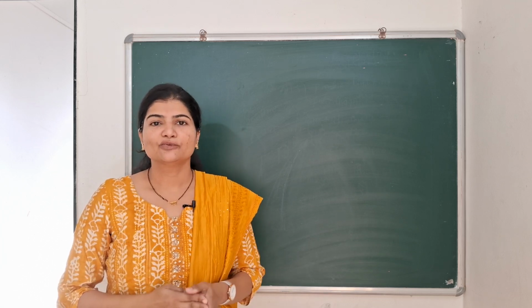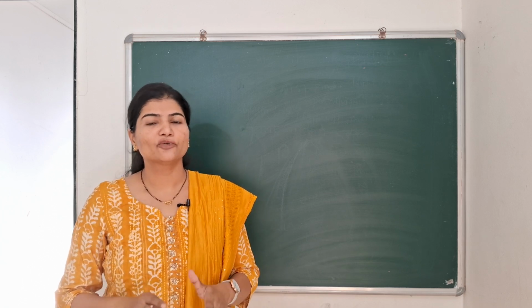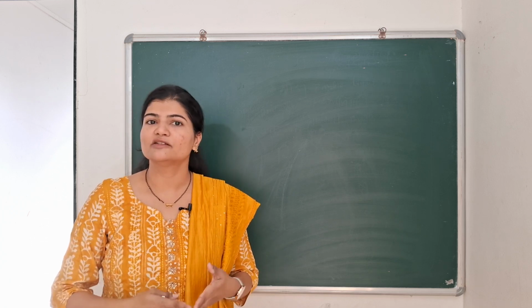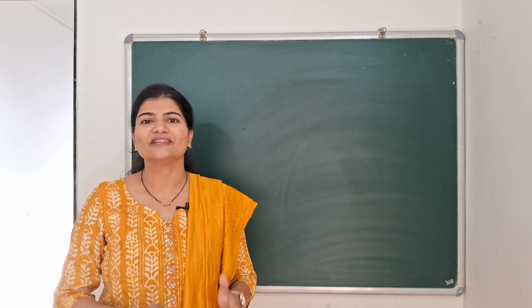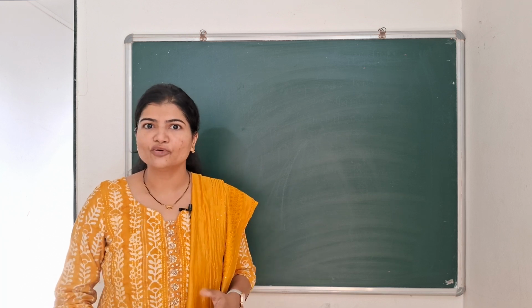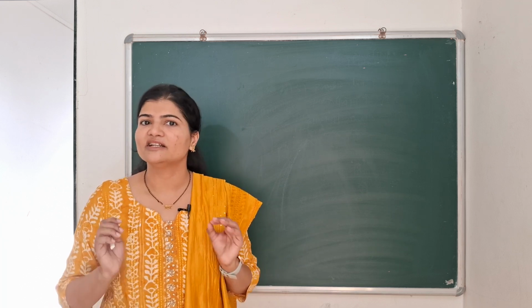In the previous video, we discussed the titration curve for precipitation titrations. In this video, we are going to talk about the methods of endpoint detection in precipitation titrations. This point is very important from your exam point of view. For 10 marks, this question will definitely be asked.